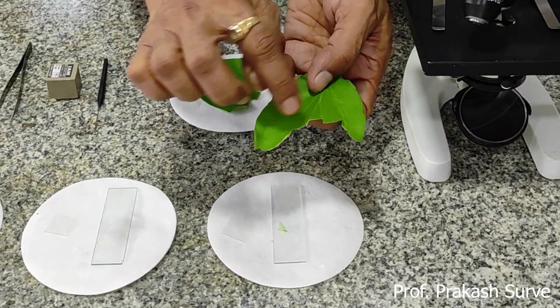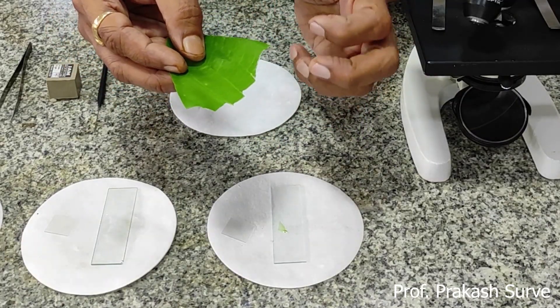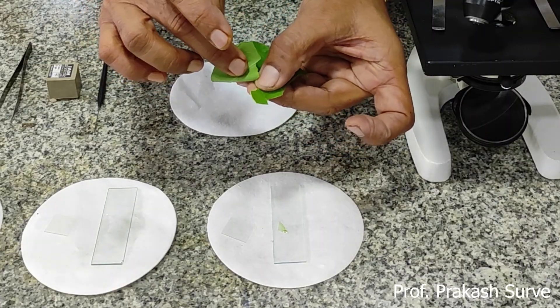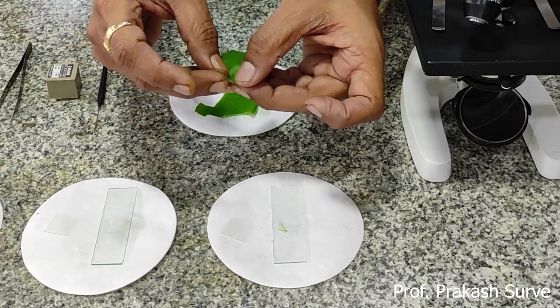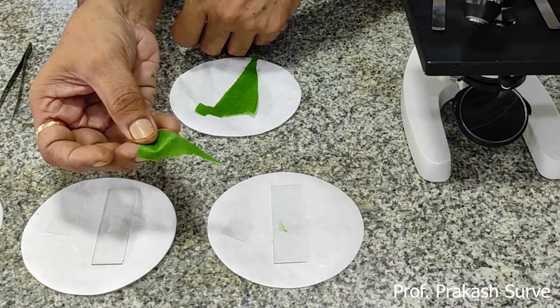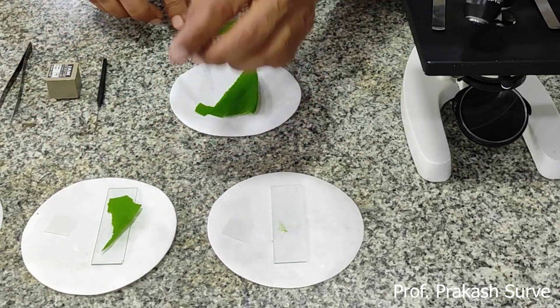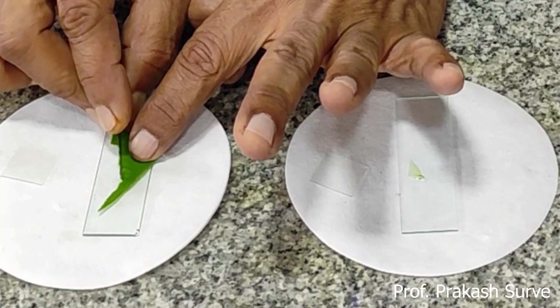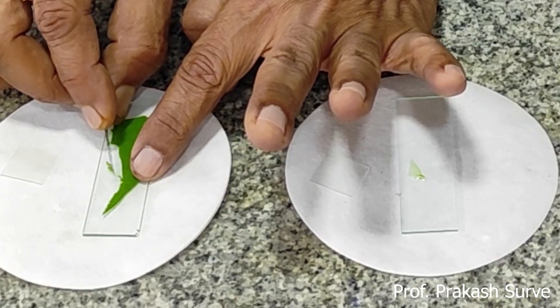Now we will take another part of the leaf and try to get the upper epidermis. To get the upper epidermis it is a little bit difficult — you have to try two or three times. Now in the upper epidermis we also got one layer, which is a very thin single layer of epidermis. Same way we will cut the portion where we can find a single layer and keep that portion in the drop of water.